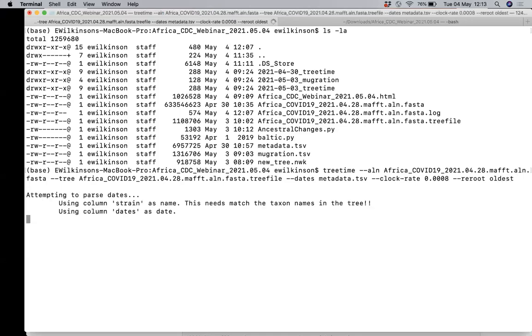And that should run. This takes quite a long time, so I'm going to stop it right here.